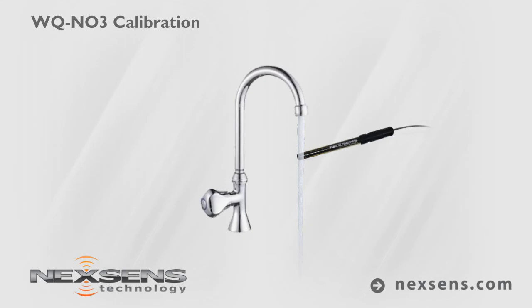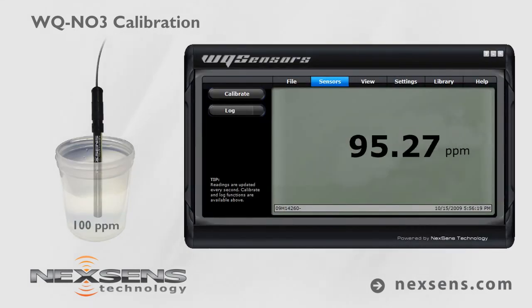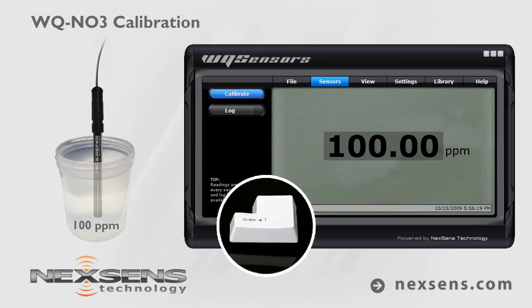Rinse and shake off any excess water. Submerse the probe in the 100 parts per million standard. Again, wait for the reading to stabilize. Adjust the value to 100 parts per million and press enter.